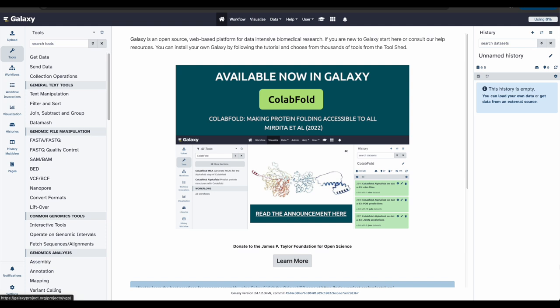In this tutorial, we aim to answer the question: in human chromosome 22, which exon has the highest number of single nucleotide polymorphisms, or SNPs?